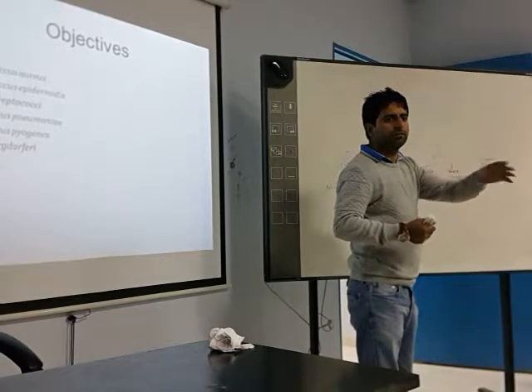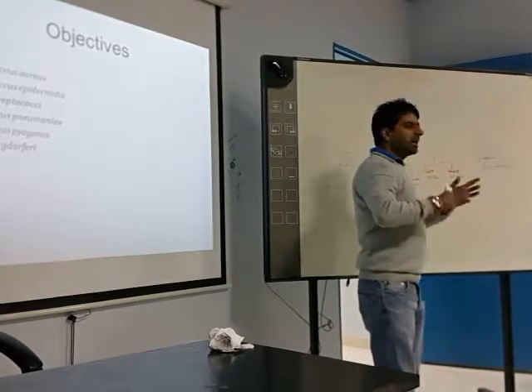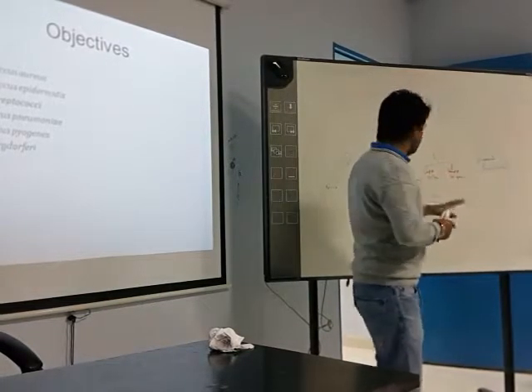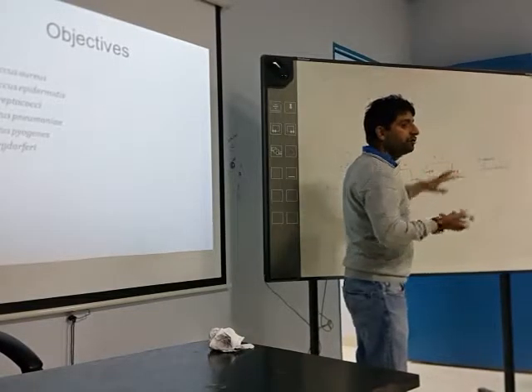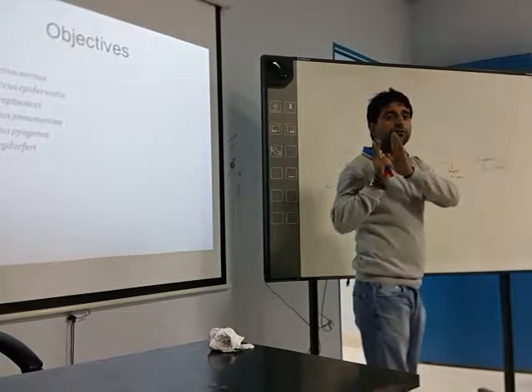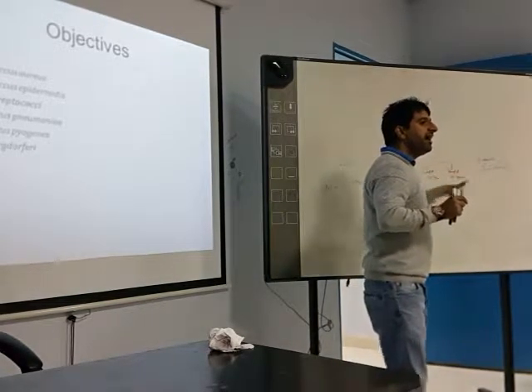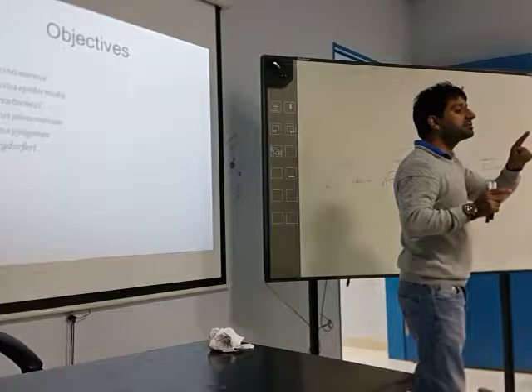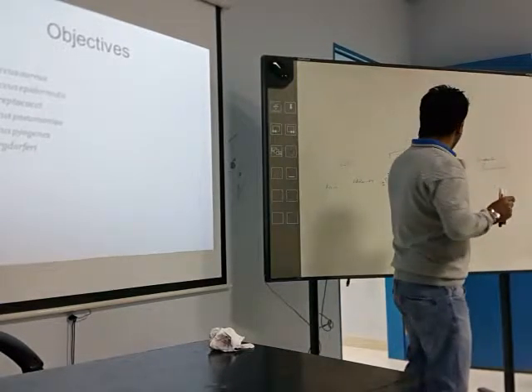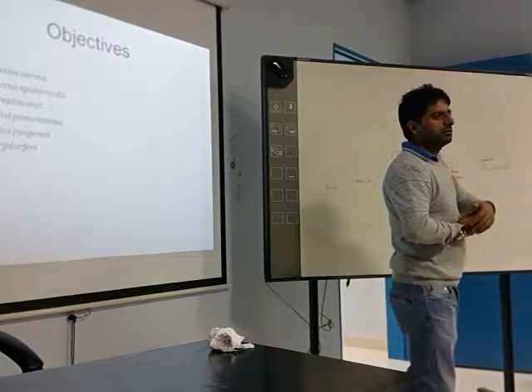Streptococci. You want to see whether it is alpha hemolytic or beta hemolytic. If it is alpha hemolytic, then you have to differentiate between Streptococci pneumoniae and viridans. If it is beta hemolytic, pyogenes.